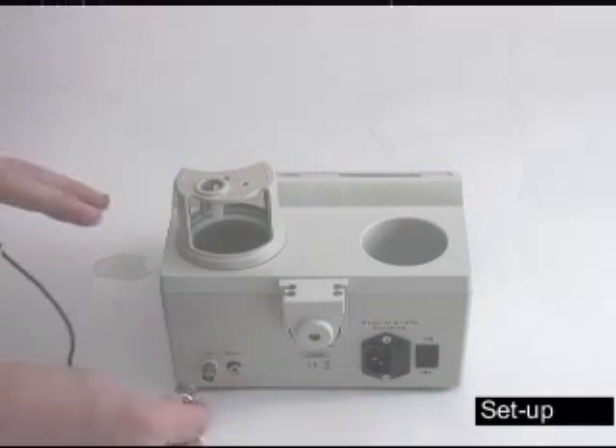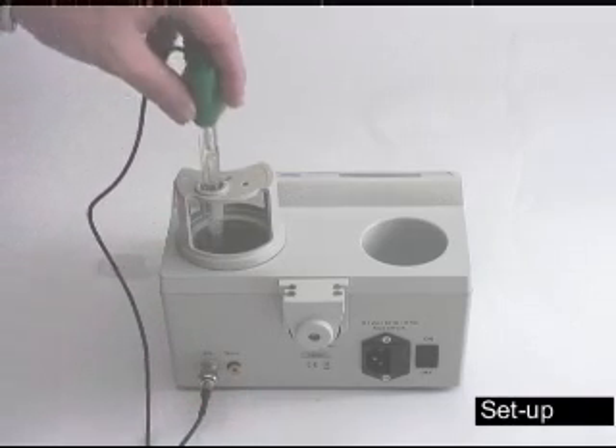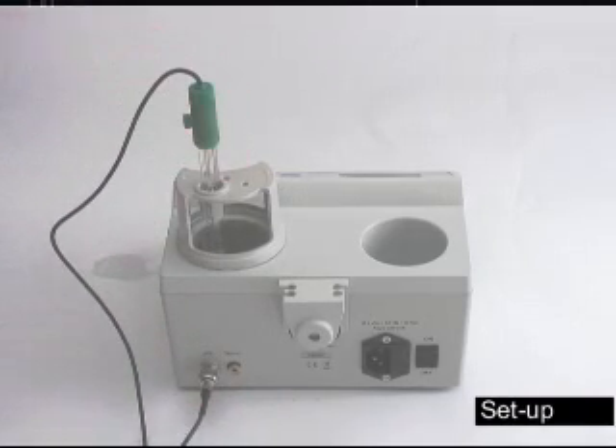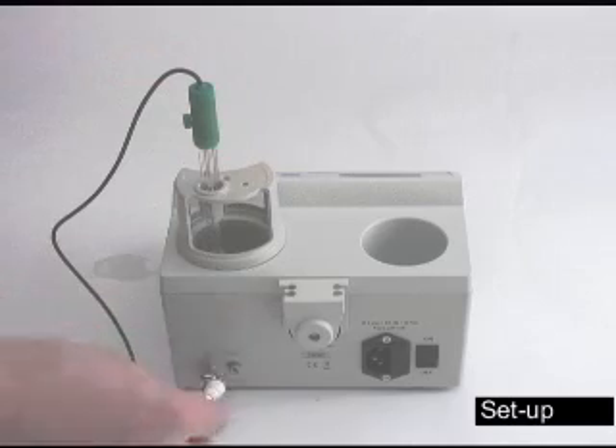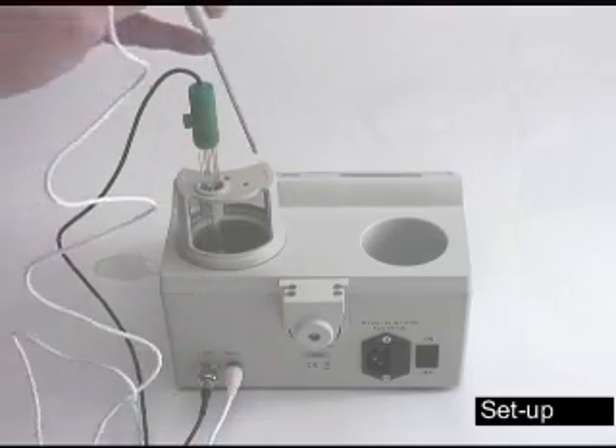The pH probe will simply slide on and then twist in a clockwise direction to lock into place. Place the probe in the holder. The temperature probe simply slides in and place it opposite of the pH probe.